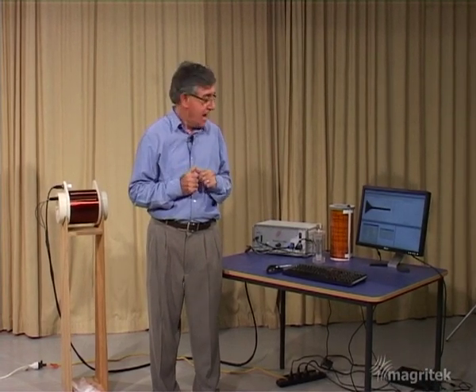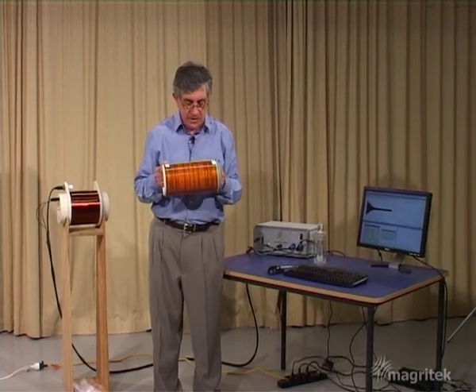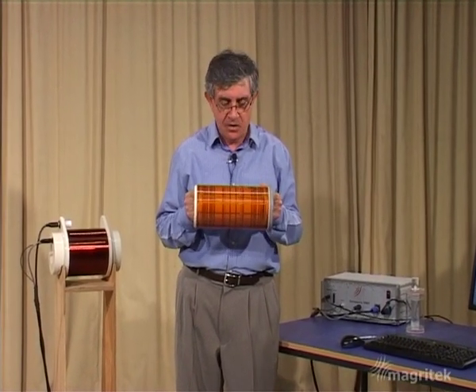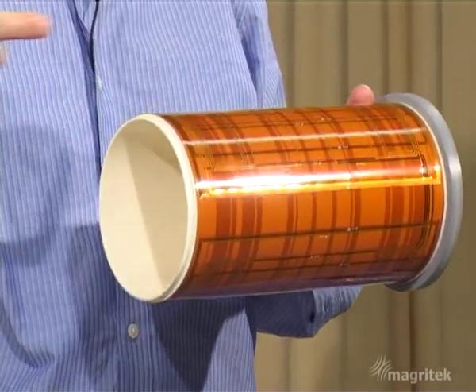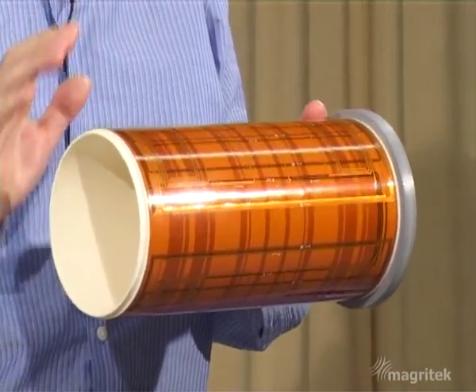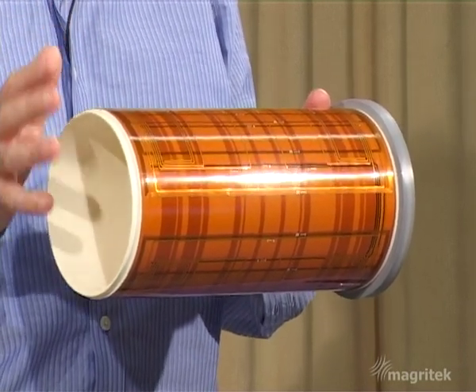Well, it turns out that we can, because inside the Terranova probe is this set of complicated looking coils known as magnetic field gradient coils. And what they do is to provide a magnetic field that varies linearly in three orthogonal directions, so that by putting a small amount of current in these coils, we can correct for imperfections in the Earth's magnetic field.